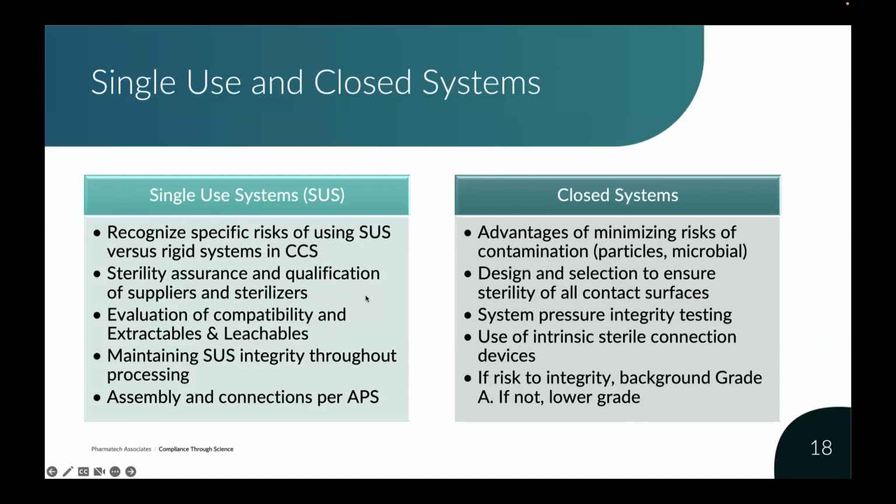It's very important to understand the sterility assurance and qualification of suppliers and sterilizers. It is not sufficient to just simply say, I bought it off the shelf and they sent me a spec that says it's sterilized. You need to understand, if they're gamma sterilizing it, are they doing the quarterly dose audits? How does their qualification of sterilization apply to maybe your specific configuration? I mean, because you can configure your bag differently, and maybe it's significantly differently configured than what actually is being qualified as sterile.